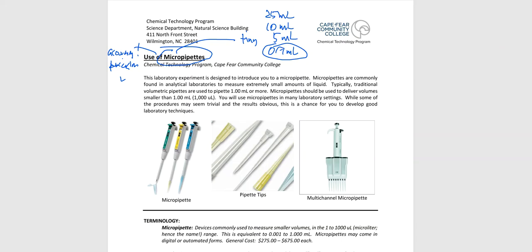It's simply, let's suck up some water into these pipette tips. Let's deliver that water. Let's make sure we can do that process the proper way, because later on in the semester, when we've got to go to these things again, I will be ready for it. I will know how to use them because I've already gone through the gauntlet of generating data and having Crazy Tracy check my data. And then he kept saying, no, no, no, no. And then I'm going to show him, yes, yes, yes, I can do the job. And here's the proof.